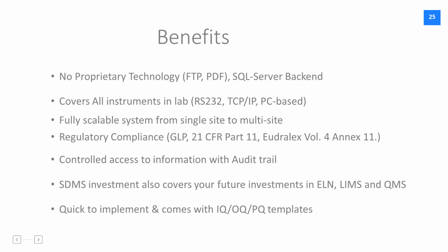Logilab SDMS is quick to implement. We provide full-fledged validation services including IQ, OQ, and help laboratories when they are conducting the PQ.